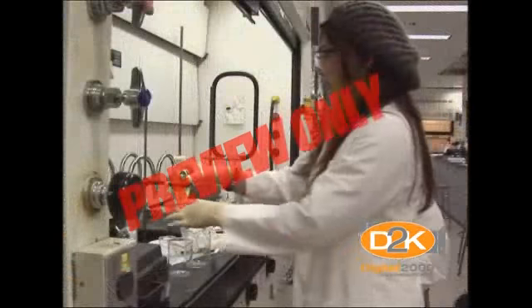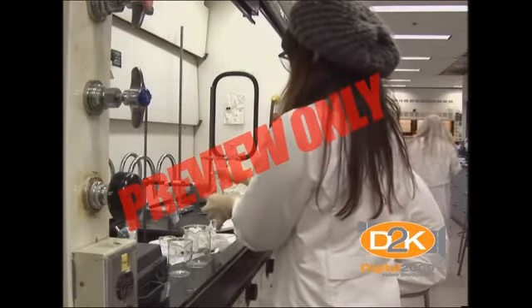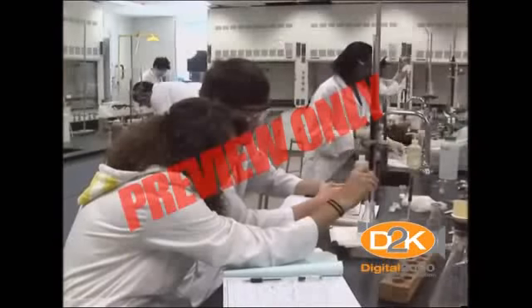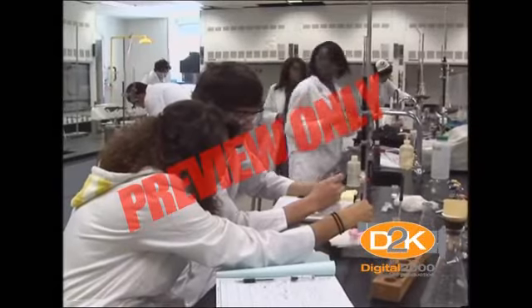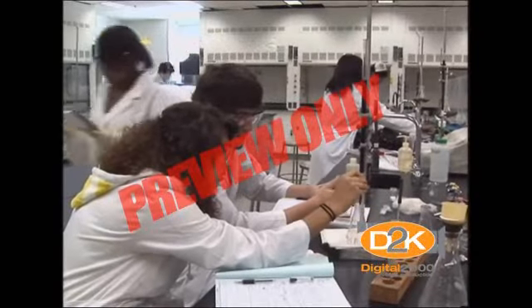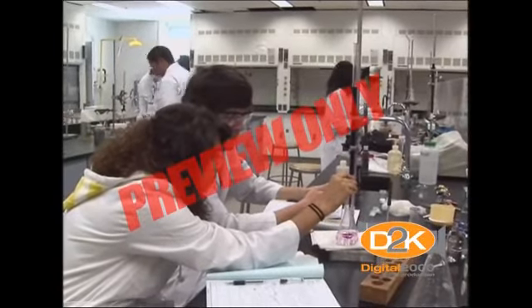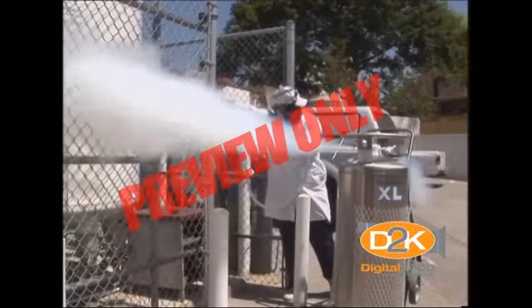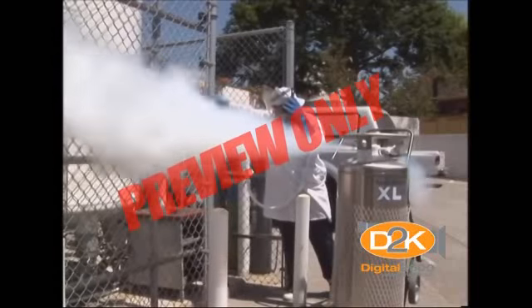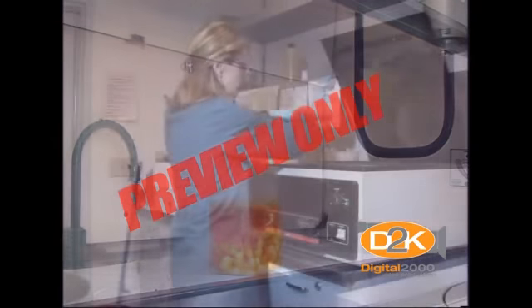The physical and chemical properties of a chemical affect how it is absorbed by the body and the rate of absorption. A common way for chemicals to enter the body is through direct contact with the skin or eyes. Skin contact with a chemical may result in a local reaction, such as a burn or rash. Inhalation is the most common route of entry for chemical vapors, particulates, and aerosols. The term aerosol refers to liquid and solid particles suspended in a gaseous medium.